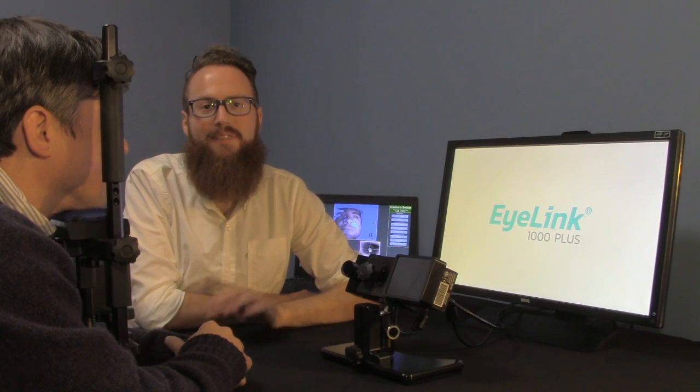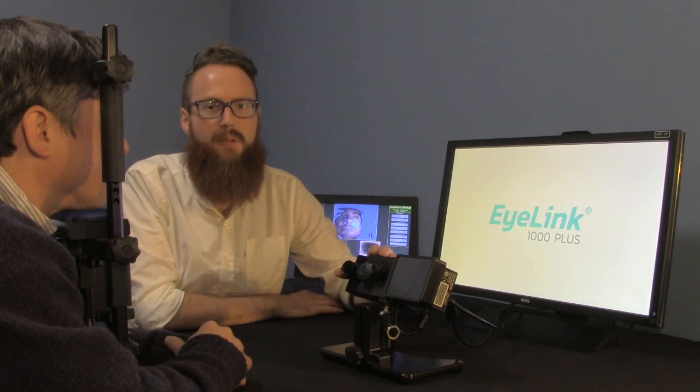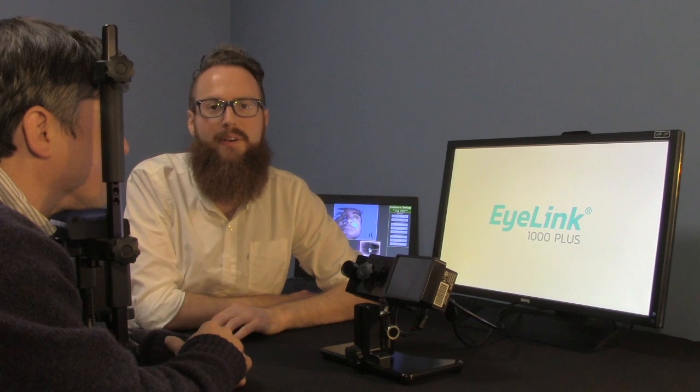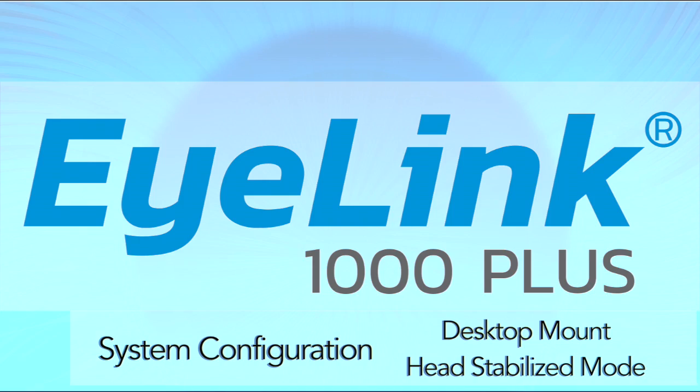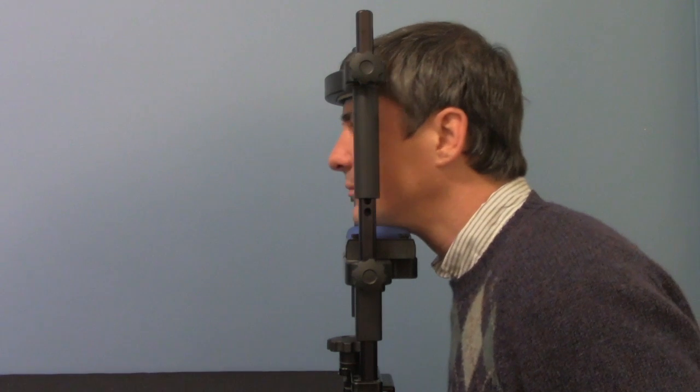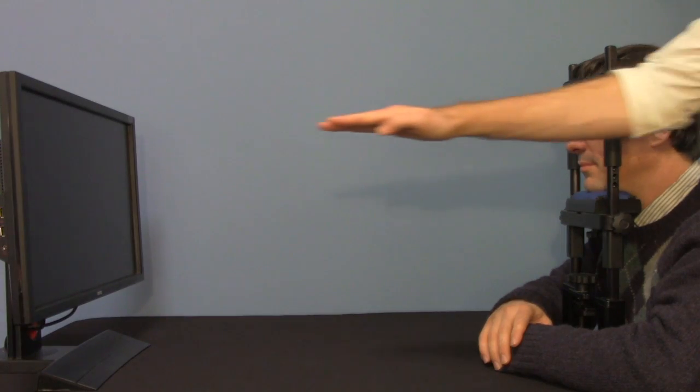Hi! In this video, we'll discuss setting up a participant using the EyeLink 1000 Plus in the desktop mount for high precision tracking in the head stabilized mode. First, we want to make sure our participant is set up as we discussed in the tracker installation videos.